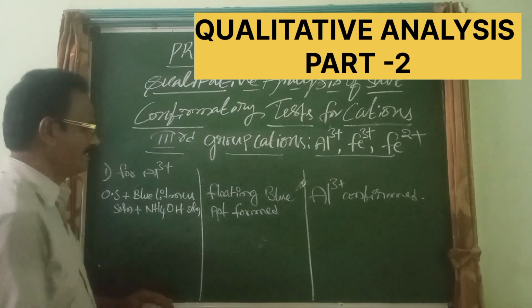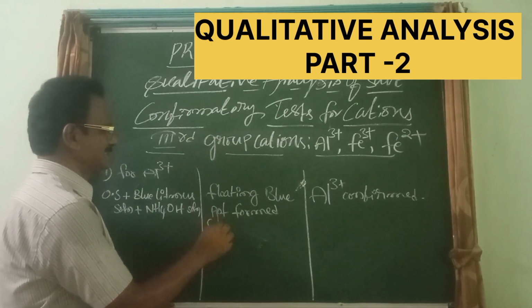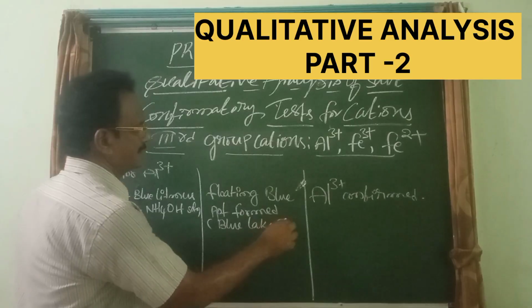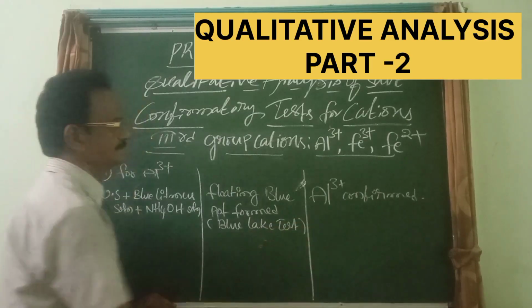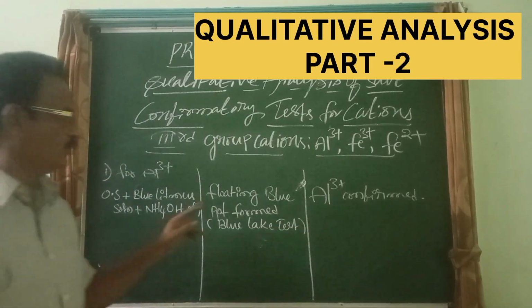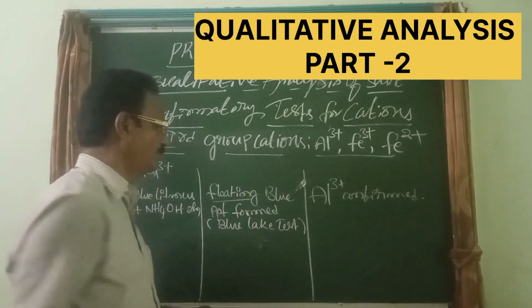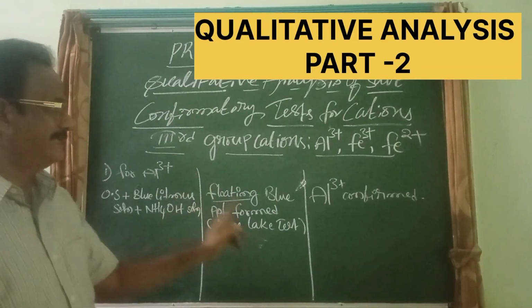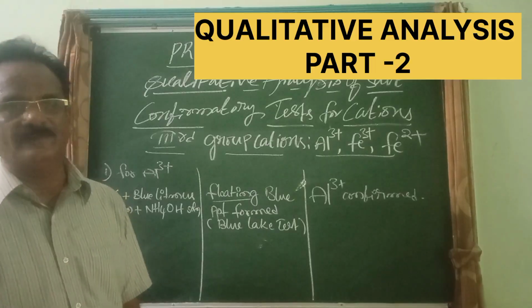This is also called the blue lake test. Is it clear? Floating, keep in mind, floating blue precipitate formed.